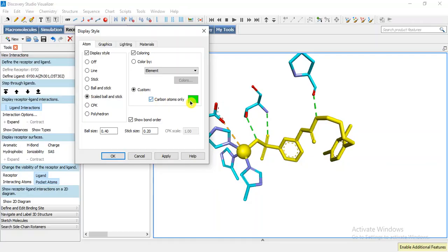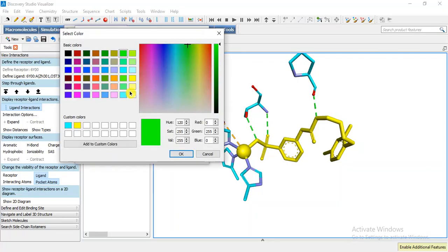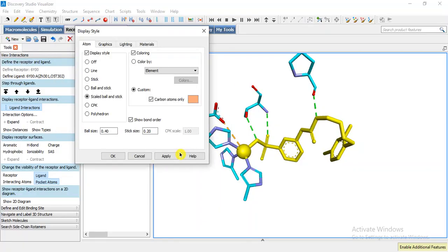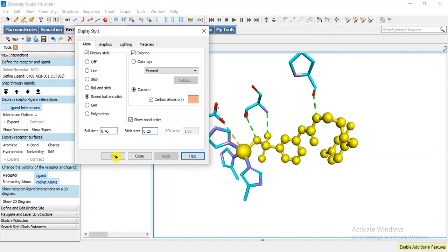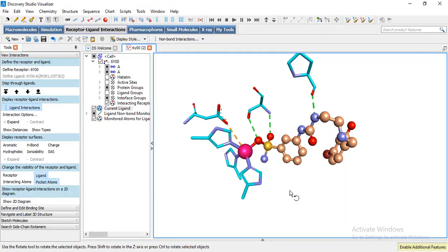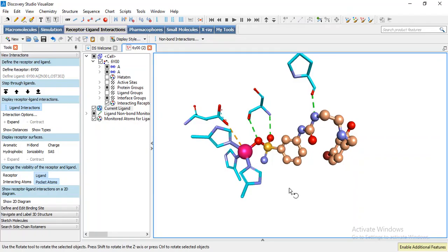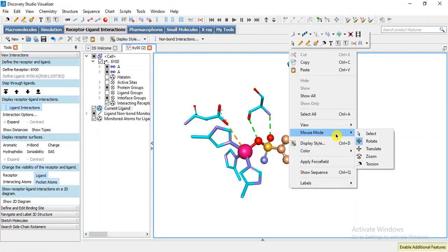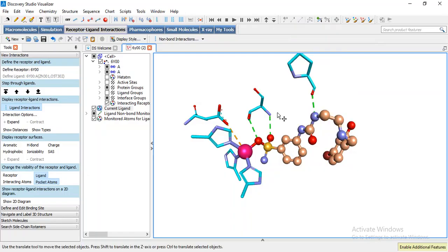The size we can change the stick size also if we want to change it like 0.25 and apply. Now this is our ligand. We can translate it. I want to move it here.